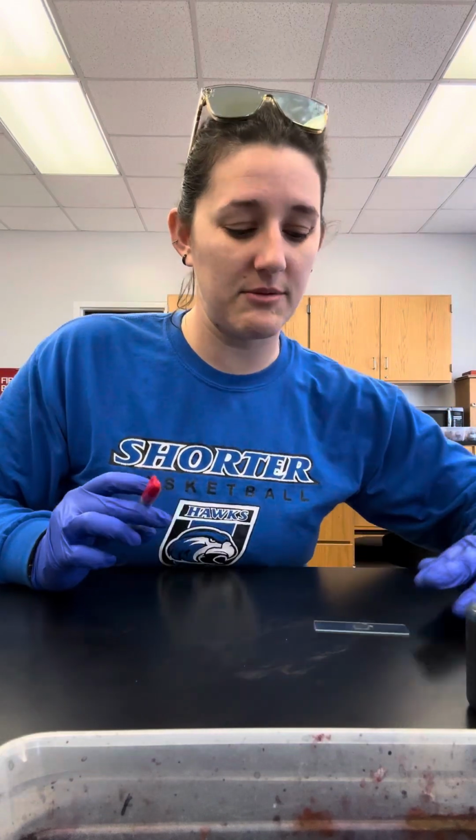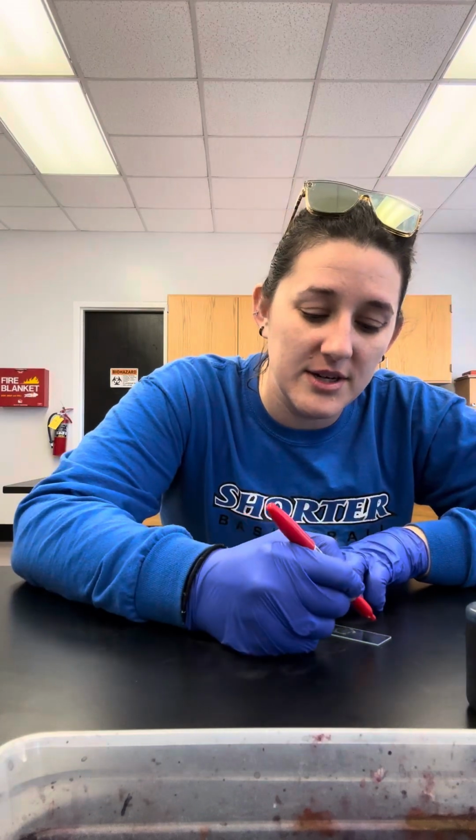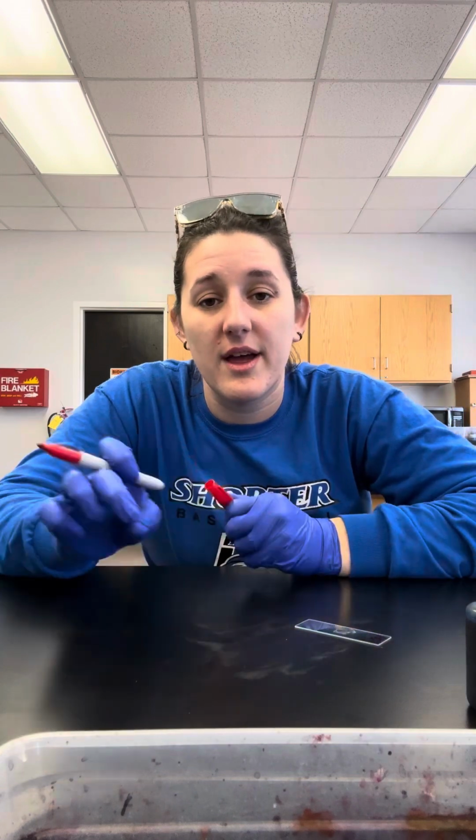While this dries, something I want y'all to remember to do that I should have done to start with. I should have labeled my slide with my initials. Just so that, when in doubt, label. Especially on slides and streak plates and all that. I know we talked about that the very first time we did this. But it's always good to label because you need to know whose is whose.